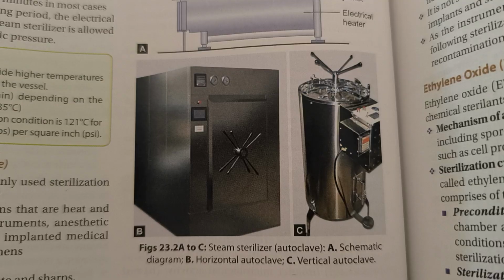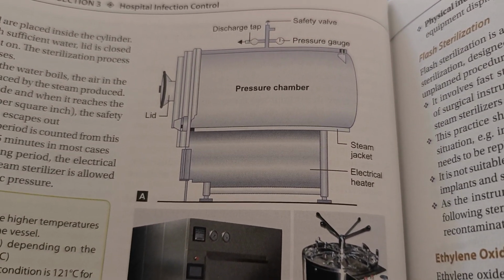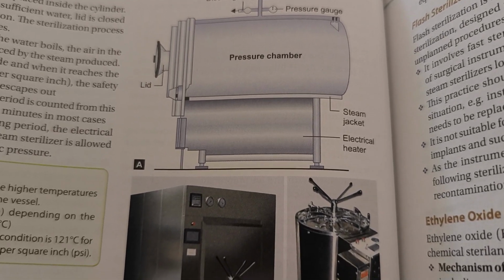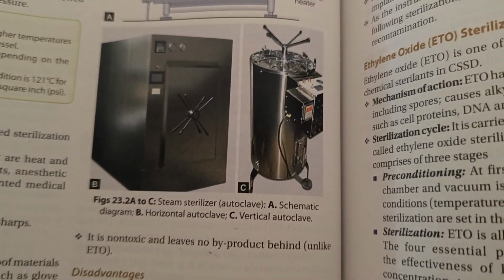So this is the figure of the autoclave, which has a safety valve, discharge tap, pressure gauge, pressure chamber, steam jacket, electrical heater, and a lid.